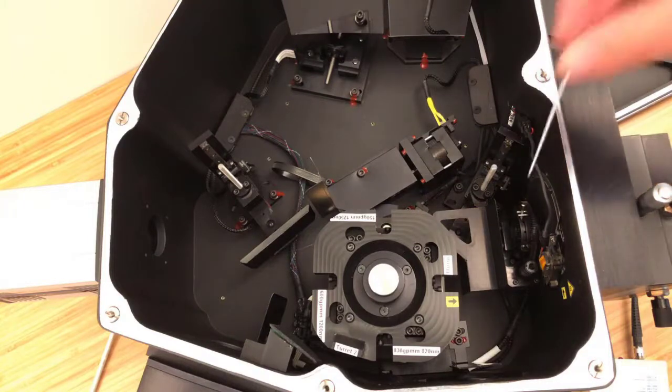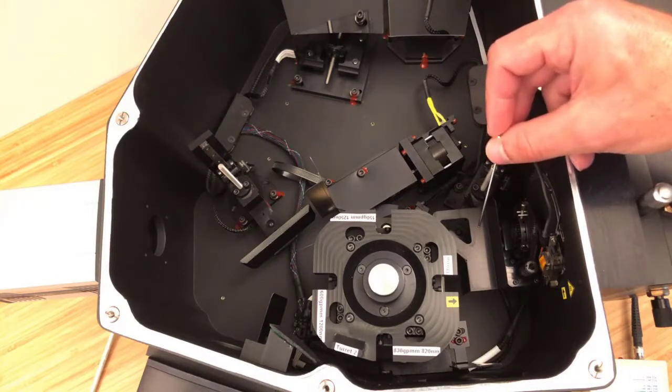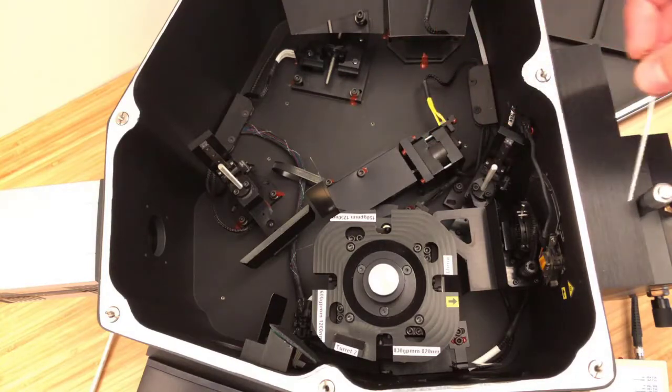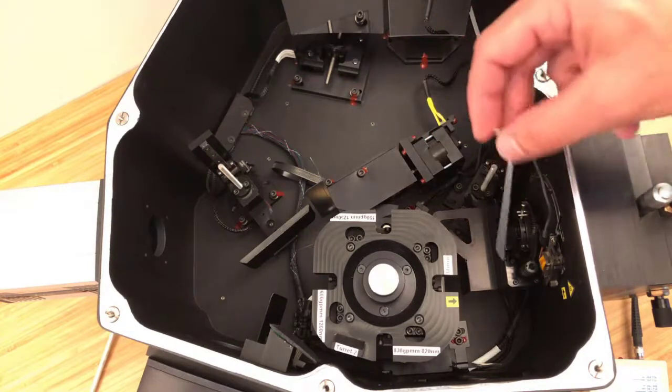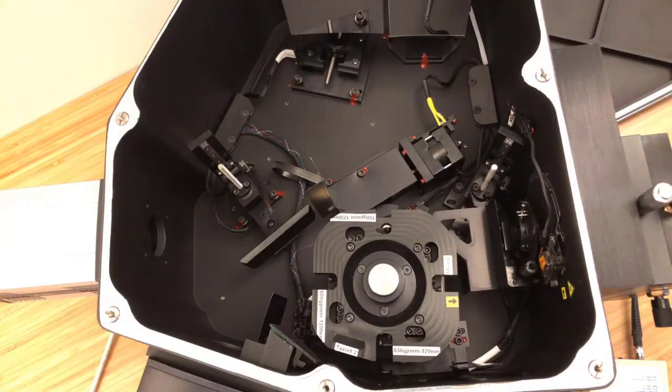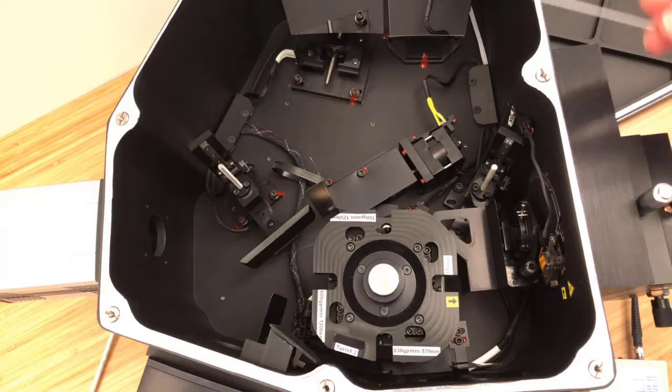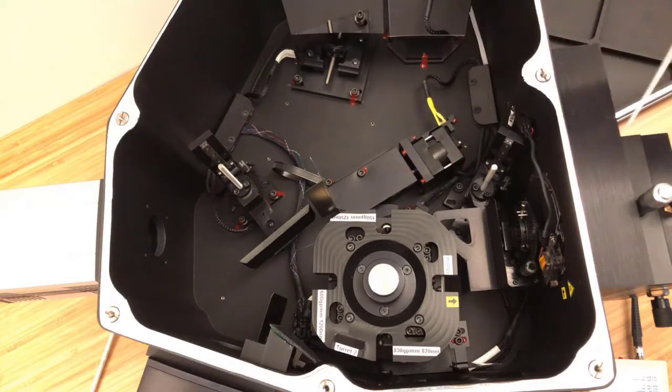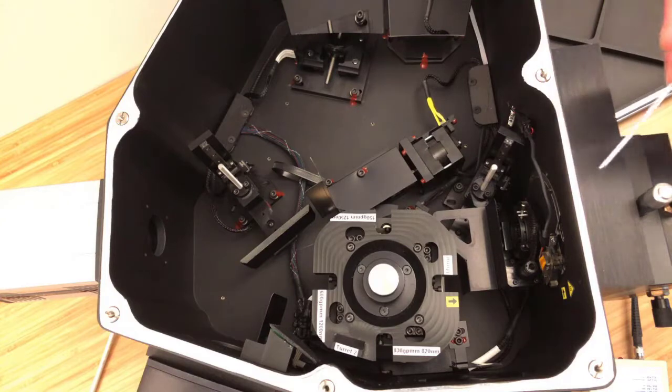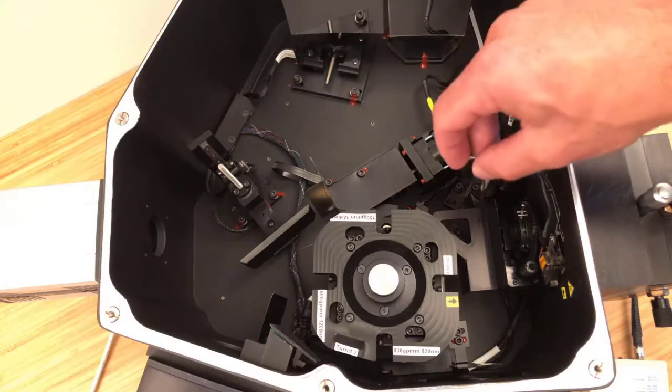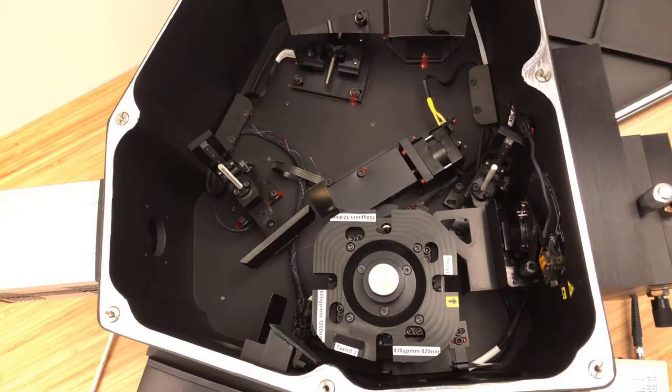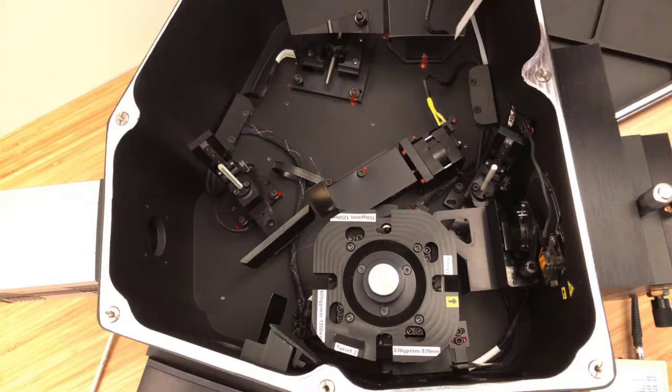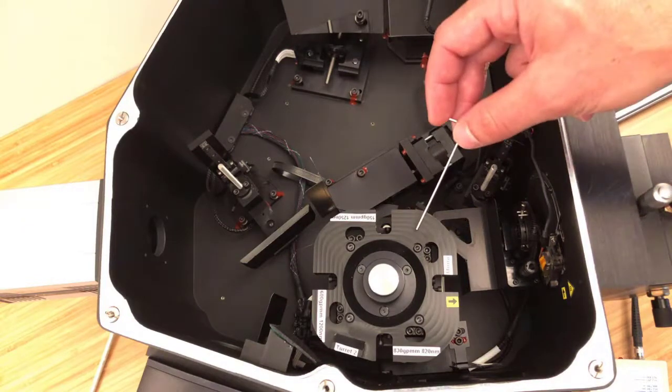Then we have a motorized turning mirror here, which controls the port selection. So when this mirror is up, this port is being used. When this mirror is down, this port is being used. It's not a flipper mirror in the sense that it doesn't flip up. It's actually on a precision linear translation stage for increased positioning repeatability. So once this mirror is up, it will bounce the light here to the collimation mirror. And at the collimation mirror, the diverging light from the source is brought into parallel rays, which go to the grating here, the diffraction grating, where the actual work is done.